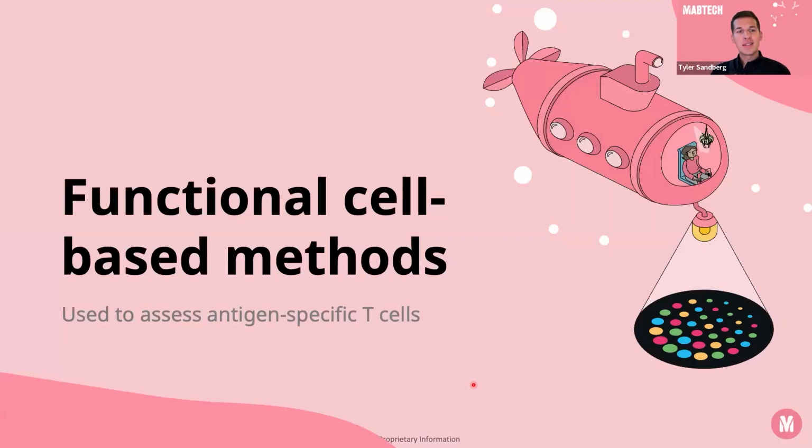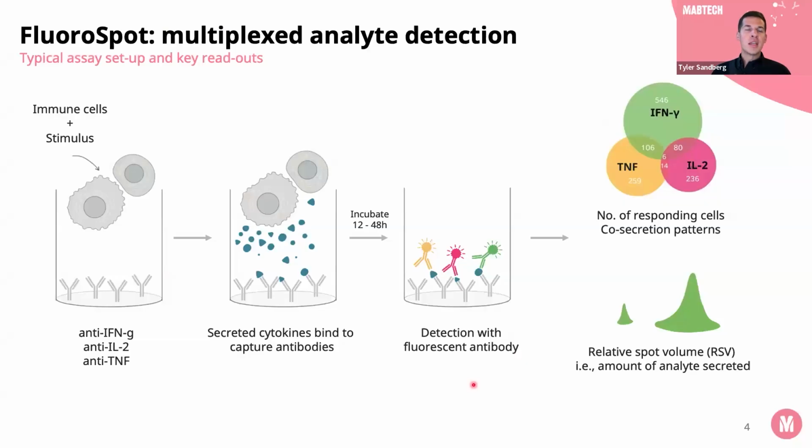And yeah, we're excited about this topic today, about good cell quality giving you good data. We'll focus on a few different methods today, so I'll give a short introduction. The first one that we'll talk a bit about is FluoroSpot. This is the multiplexed version of ELISpot.